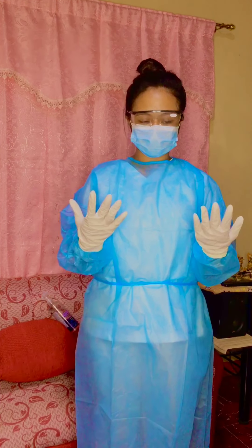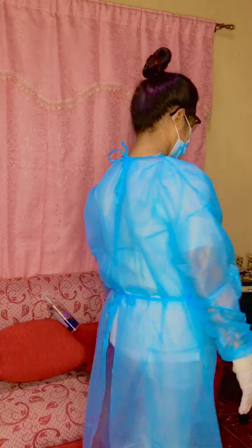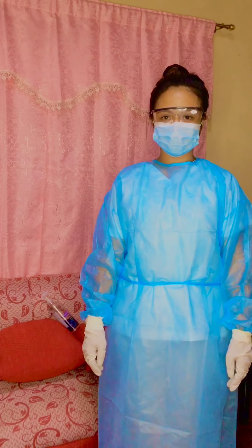Do a final check. You need to make sure that you are fully secured. So that is how I apply our PPE: gown, mask, eyewear, and gloves.